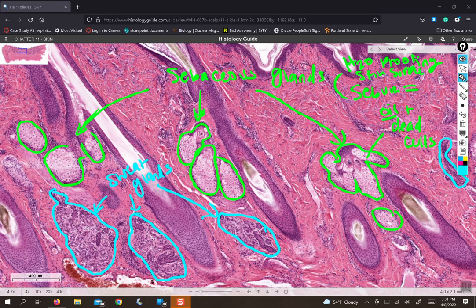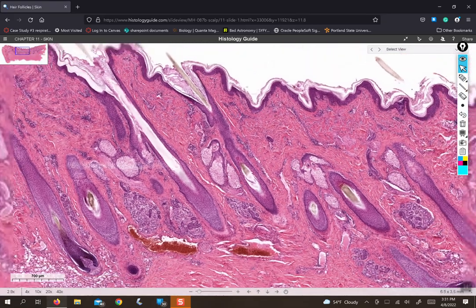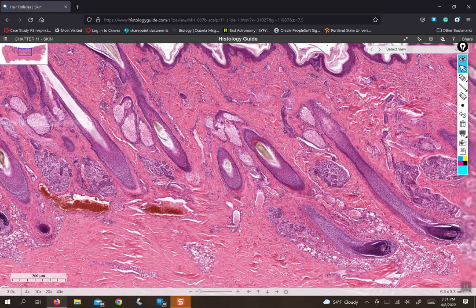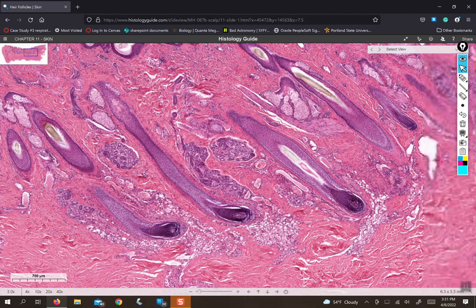So let's cruise around and see what else there is to see. There is one structure that I need to show you that I want to find a good example of. So I'm just going to kind of scan for a good example of the thing. Aha, there we go. Perfect. Okay, so let's color code this sucker so I can show you the different parts.